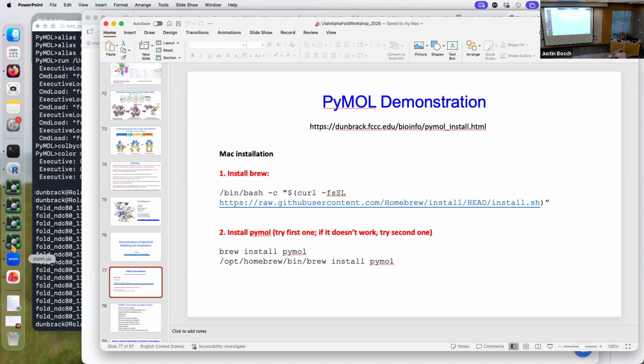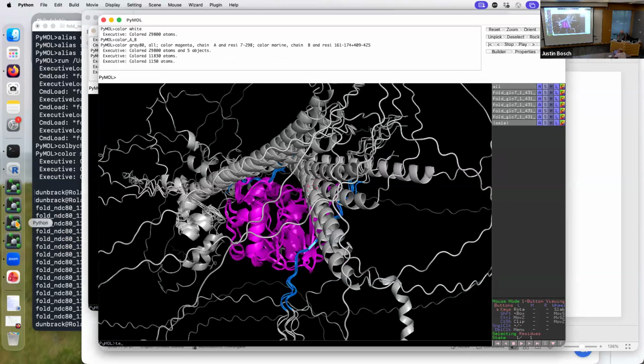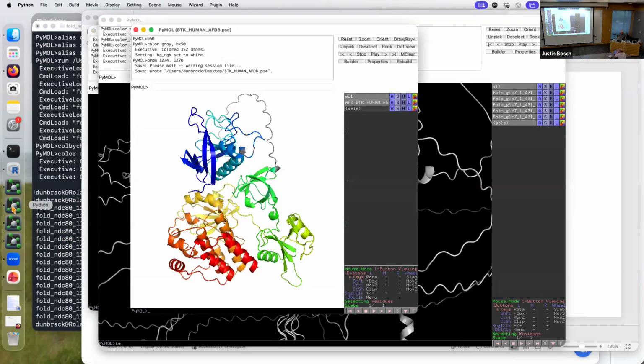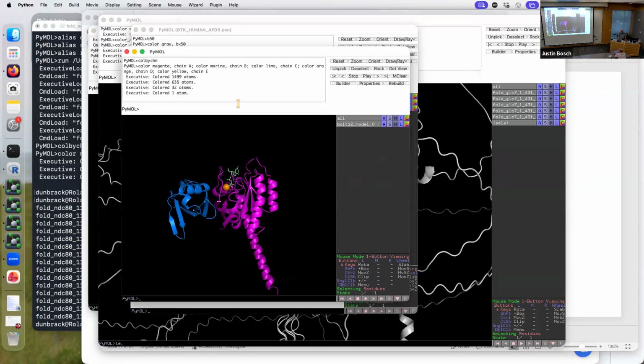I will do a little bit of PyMOL. I think there isn't so much. These are actually ones I was looking at with people here just today. Okay. This is a good example because I'm going to show the predictions from the different output programs on this particular complex.